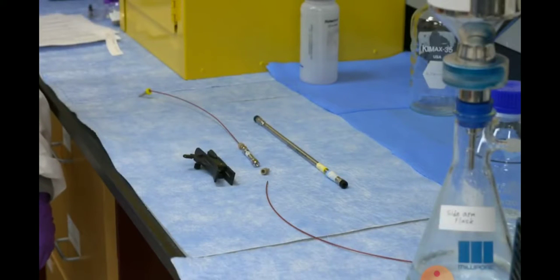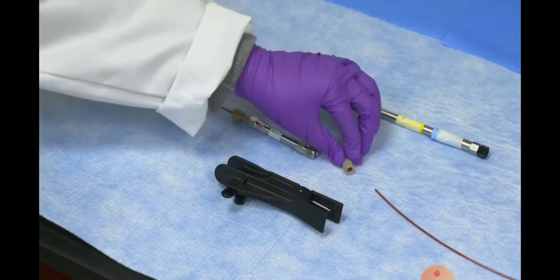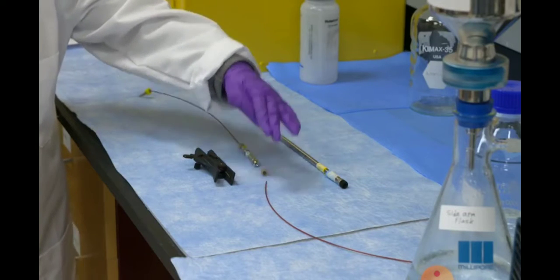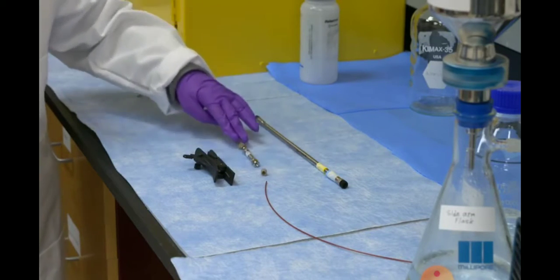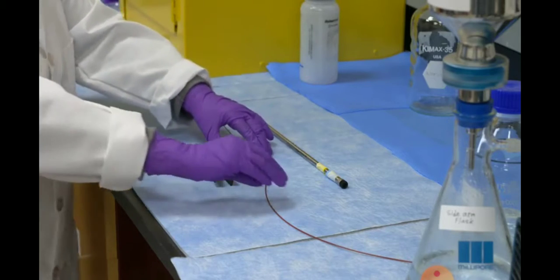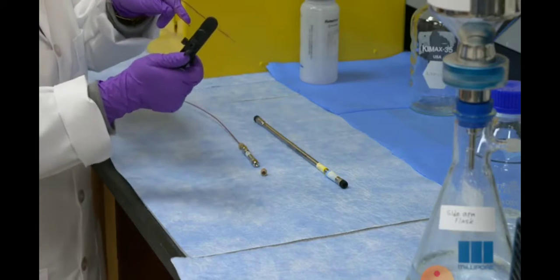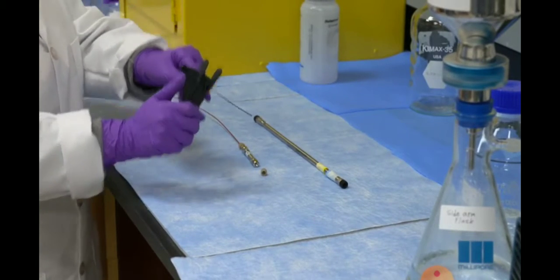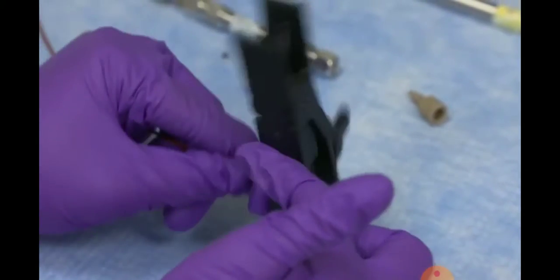Now, we will talk about the selection of the column and attaching it to a ferrule. This is called a ferrule. For this setup, you will need a PEEK tubing, cutter, column, and ferrule on each end. You'll take your PEEK tubing. To cut it appropriately, you insert it in the cutter. Instead of cutting it, you spin it.